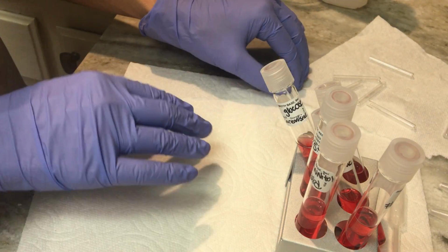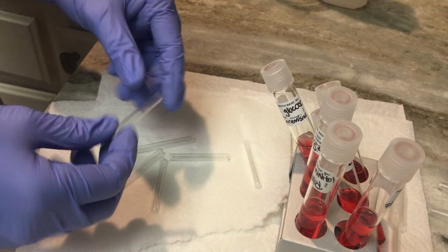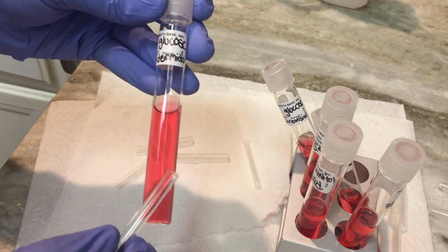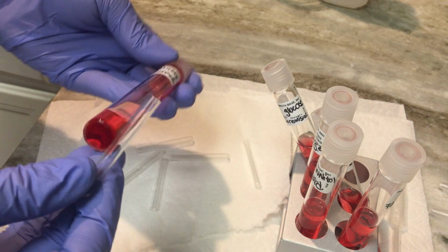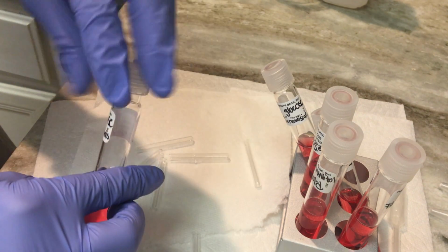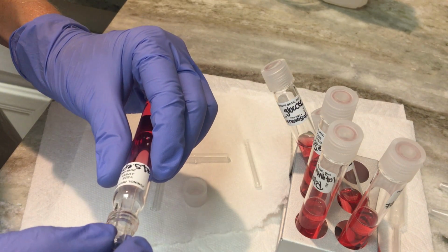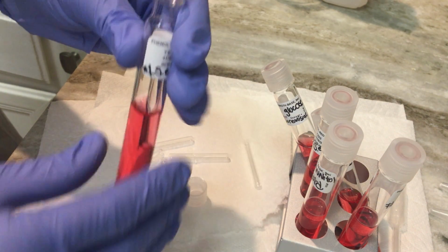Then next, I have my Durham tubes, which are pretty impressive in my mind. And we're going to place them inside of our larger phenol red broth, because remember, fermentation creates gas. So we need to put these in here, open side down. Now, I just know already there's going to be air bubbles in there. And sure enough, look at that. That means there's air in there.